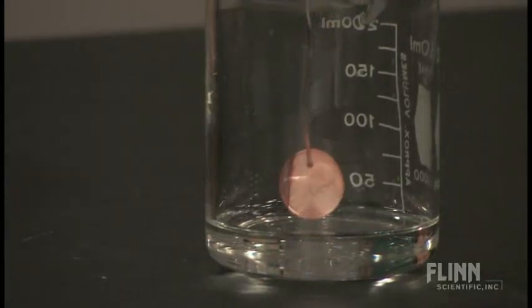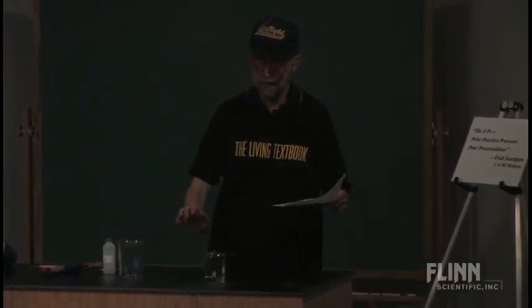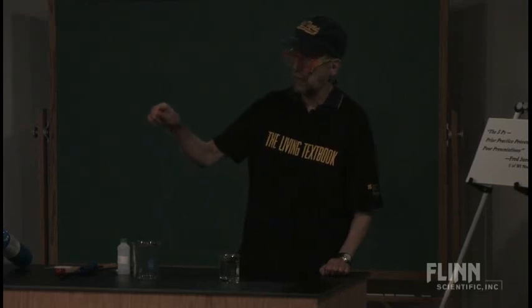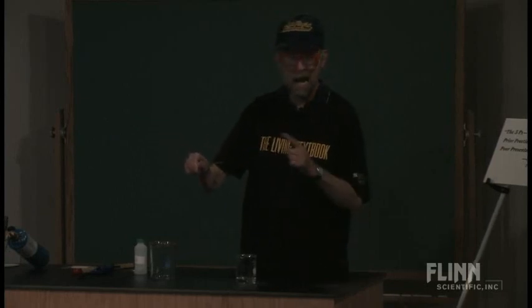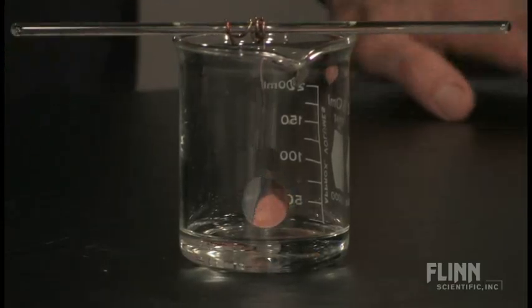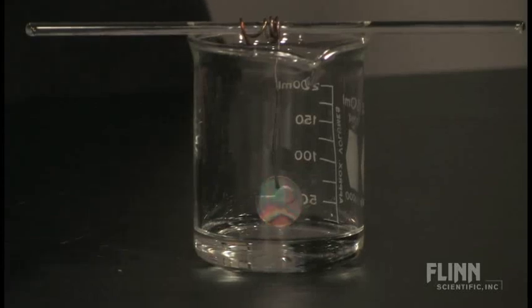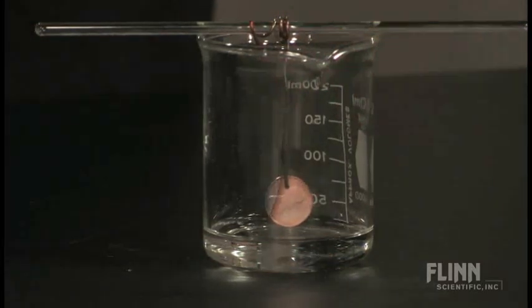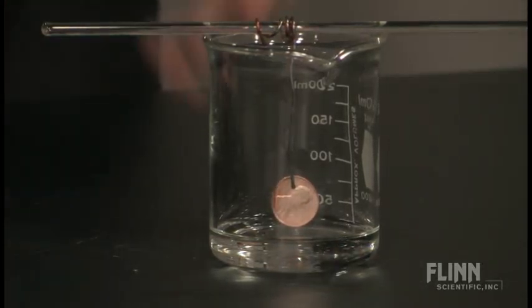This is very, very hot. If I touched a piece of paper to it, it would set the paper on fire. If I put it back in, it gets hot again. Now, if I take it out and let it cool down, it may still have enough energy — it's still above the threshold — so the reaction starts again on the surface. But at some point, if it cools down too much, the reaction will no longer take place. This will go for a long time, until the acetone runs out or the penny gets too far from the surface. The vapors are not nice, so do this in a hood. Thank you very much.